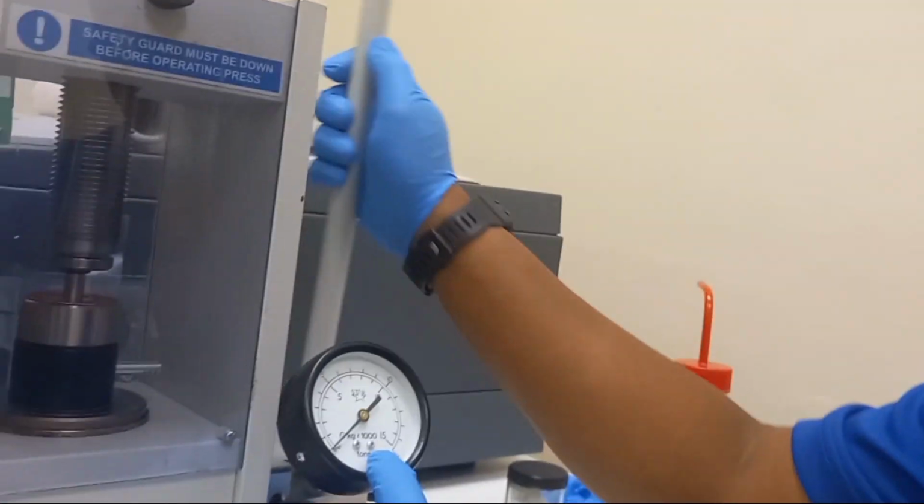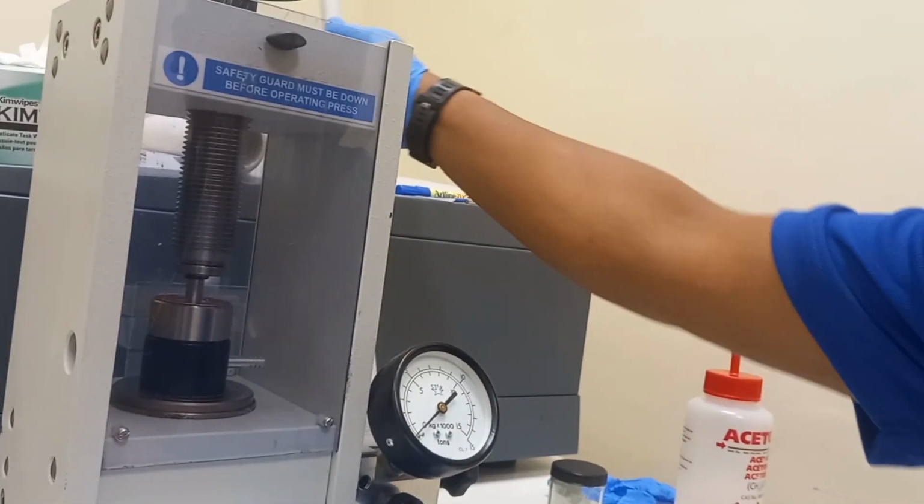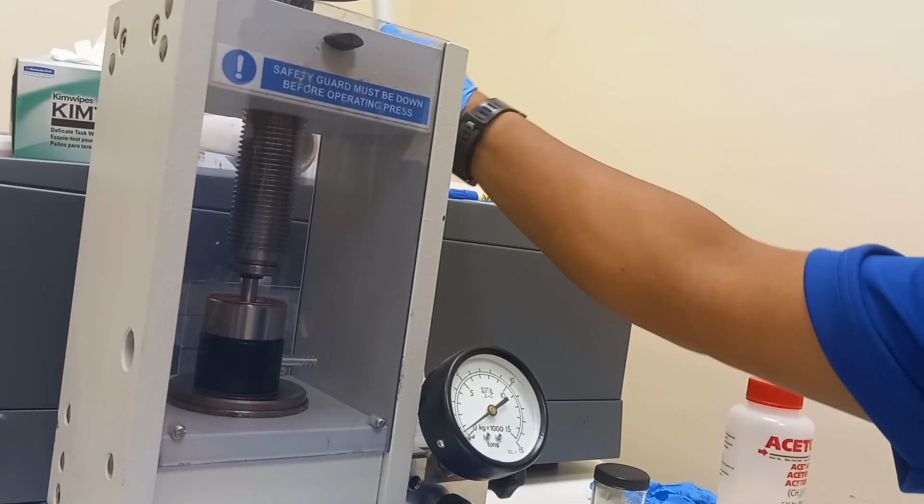The standard pressure kept in the hydraulic press is 7 tons and we keep it for around 2 minutes.